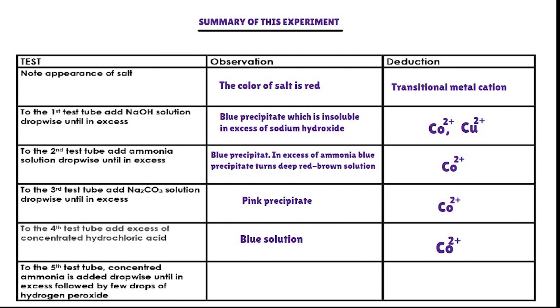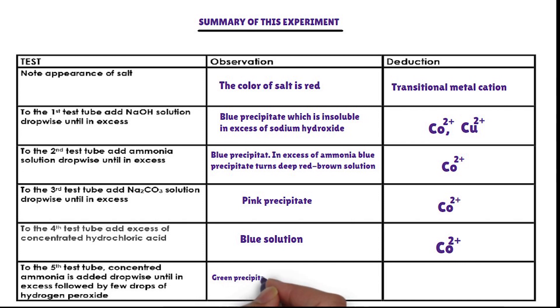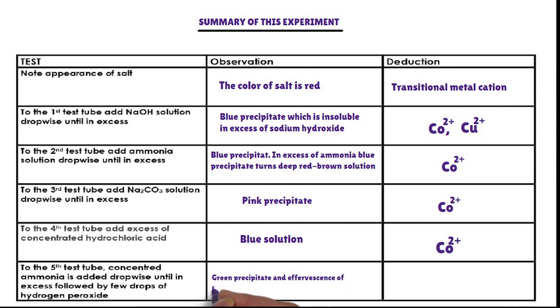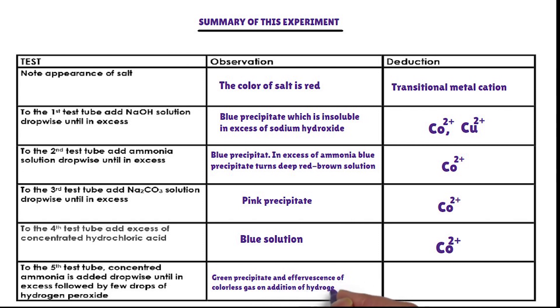Second confirmatory test: to the fifth test tube, concentrated ammonia is added dropwise until in excess, followed by a few drops of hydrogen peroxide. The cation that forms a green precipitate with concentrated ammonia and effervescence of colorless gas on addition of hydrogen peroxide is cobalt-2 ion. Cobalt-2 ion is confirmed. The cation present in the salt is cobalt-2 ion.